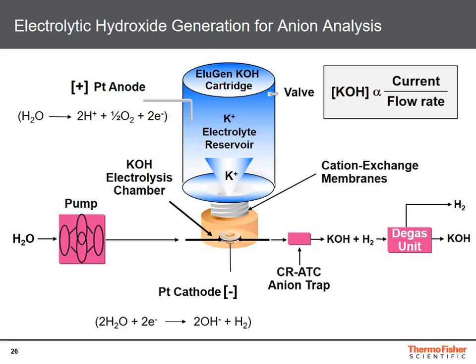On the other hand, I can also imagine to program the current over time. That means I'm changing the hydroxide concentration over time, and this is what we typically do in a potassium hydroxide concentration gradient.